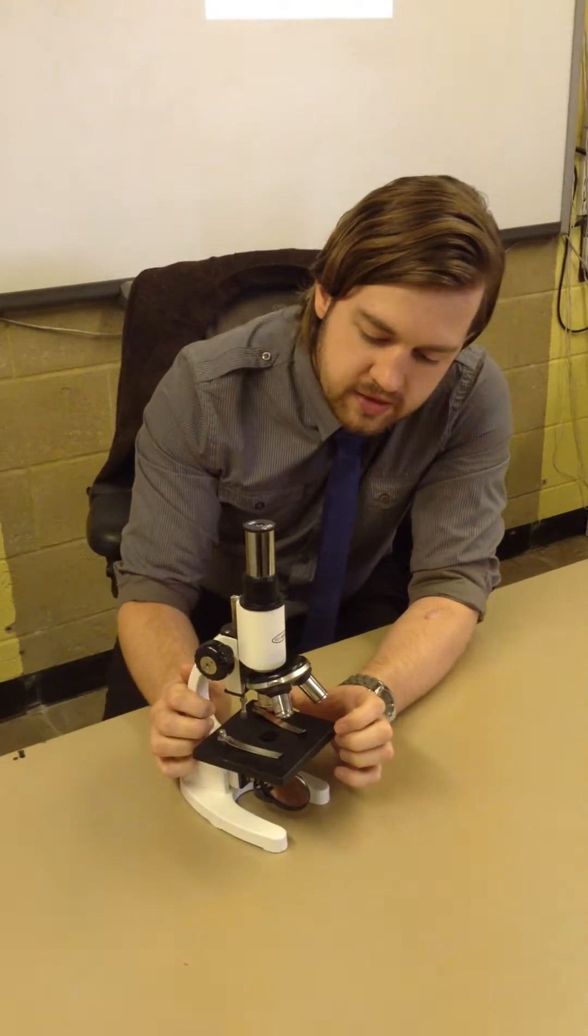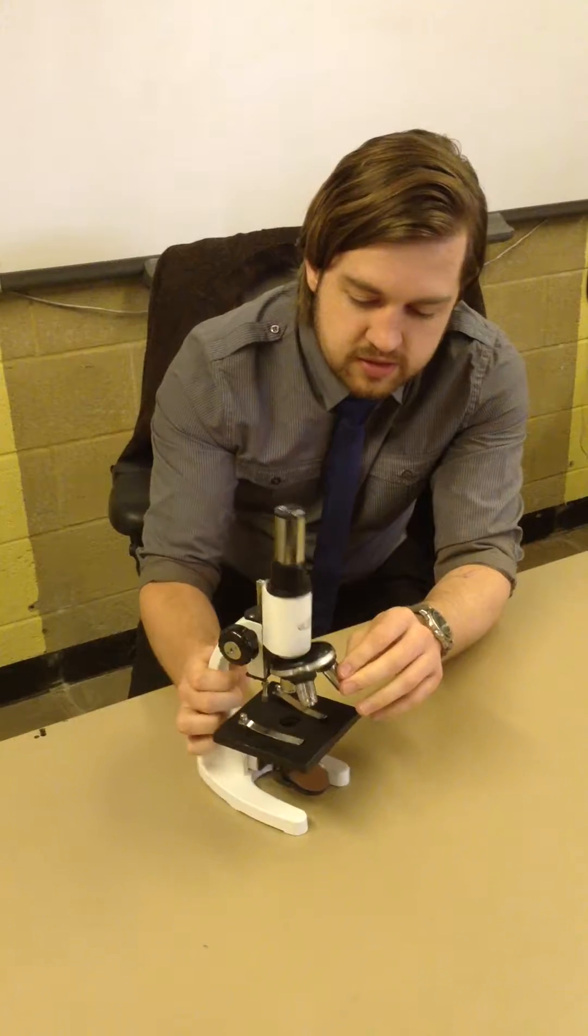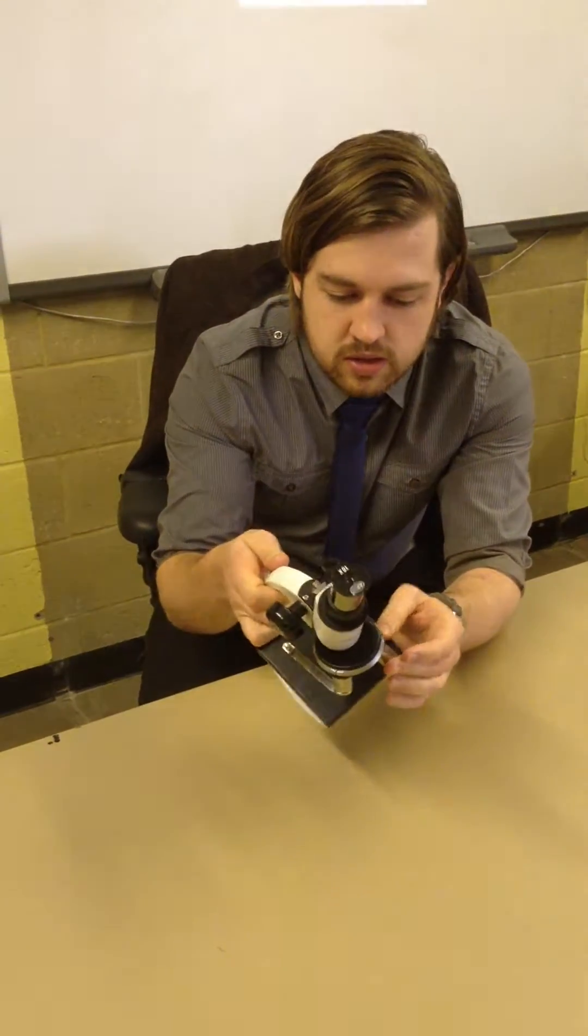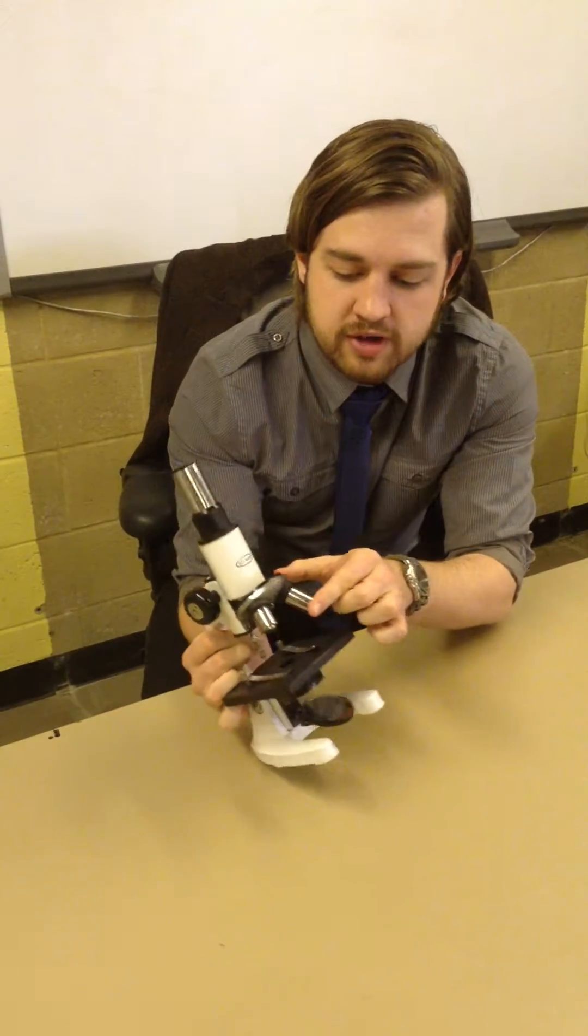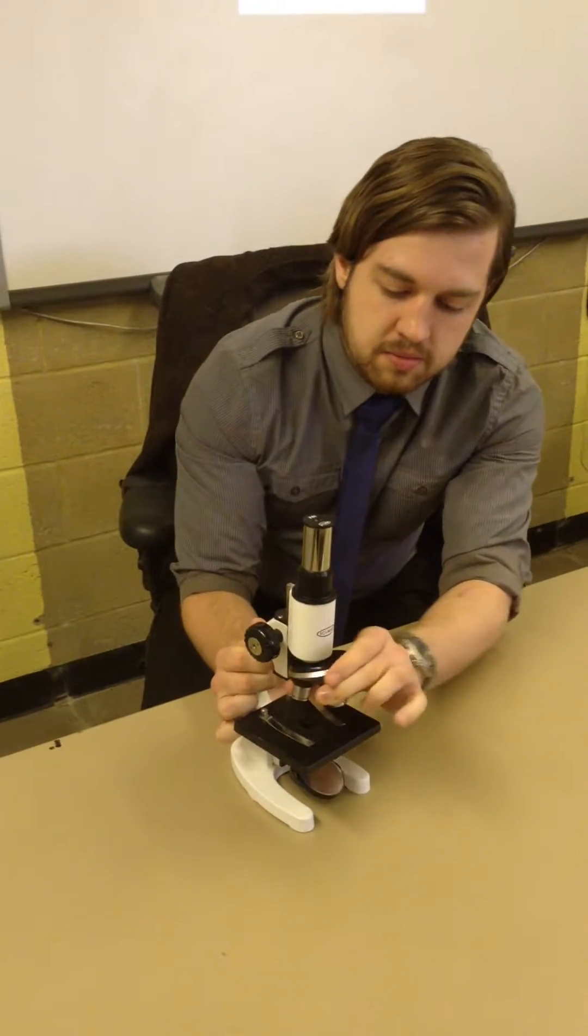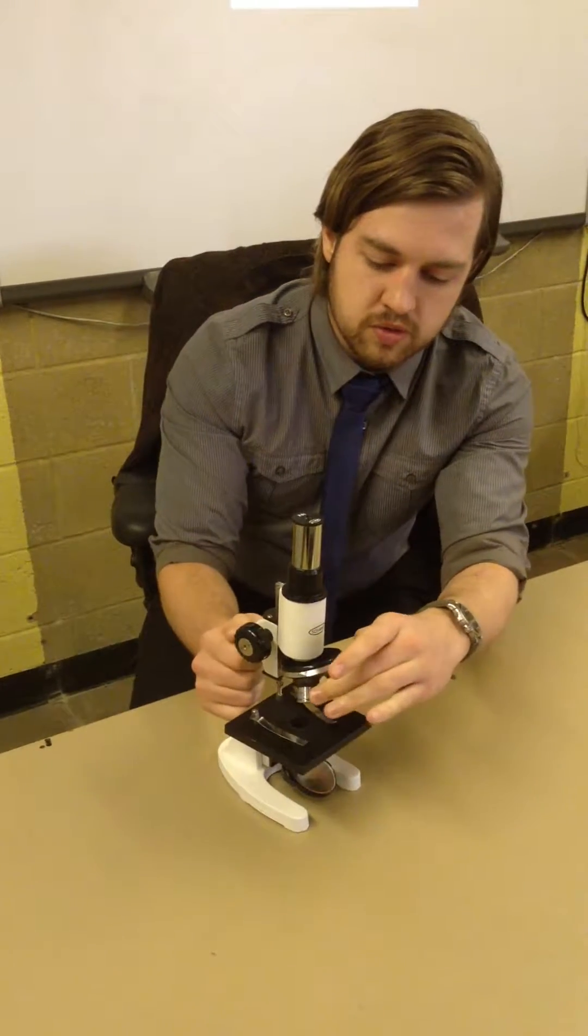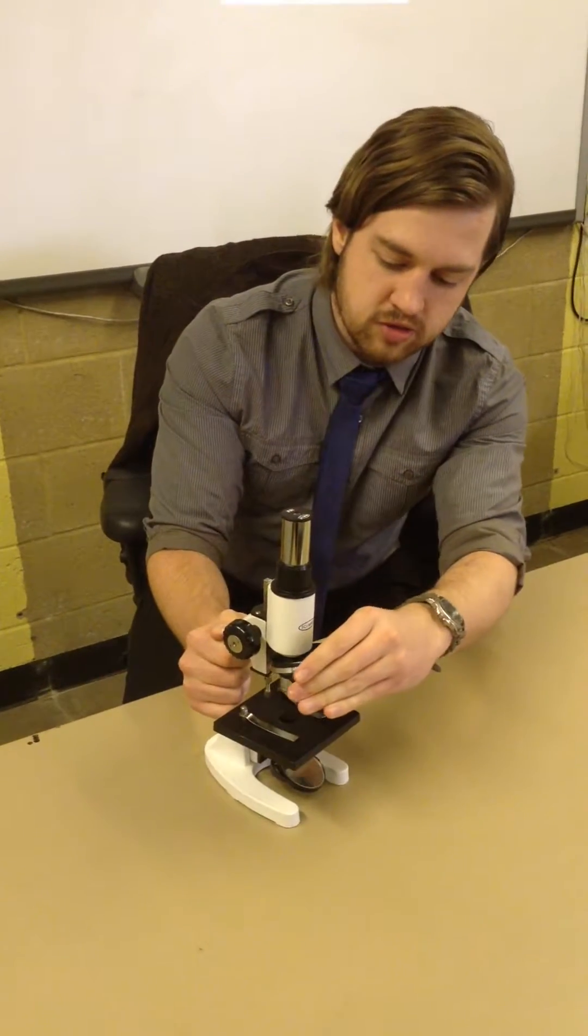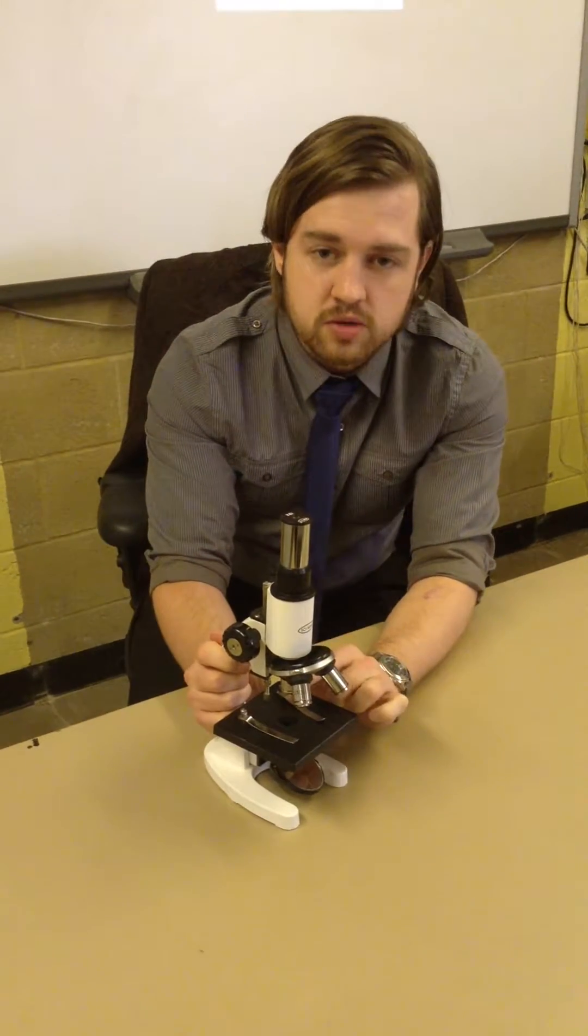After that, we then move on to our objective lenses. All the microscopes in the school have three objective lenses. There is a times 4, times 10, and a times 45 magnification. They move around in order for you to alter the magnification and increase the size of the image you were looking at. And it's very important that you always start on the smallest magnification.